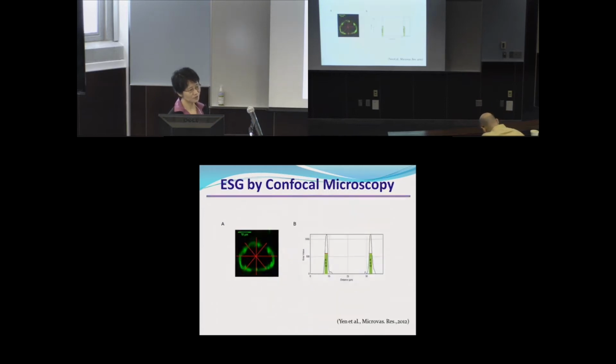After that, we observe the surface glycocalyx labeled with the anti-HS by confocal microscopy. This is one cross section, and for one cross section, we have 8 locations. If I draw a line, the red line, I get 2 spikes. We define the thickness of this layer as the distance between 2 points which have the half maximum of the highest intensity. That's the thickness. For this case, roughly 1 micron.